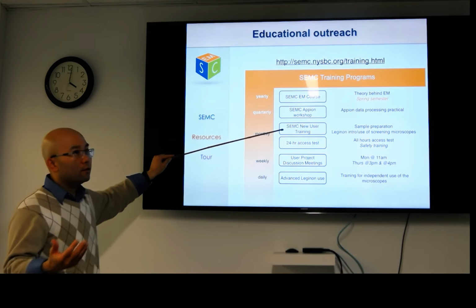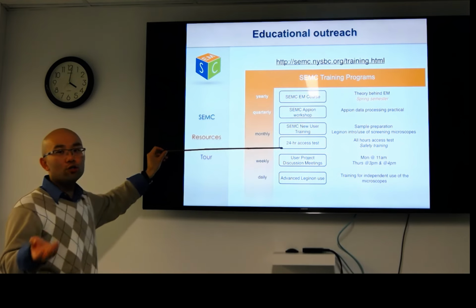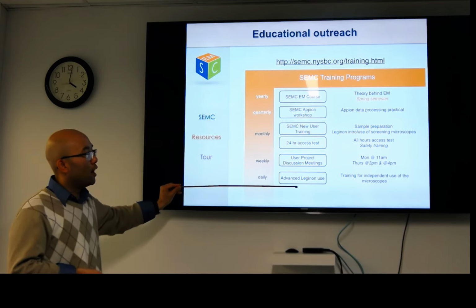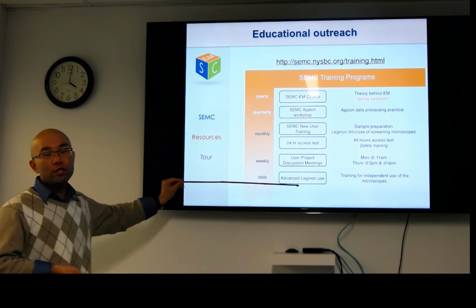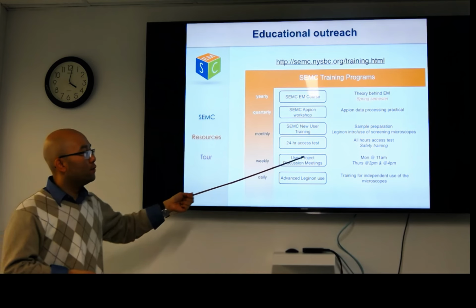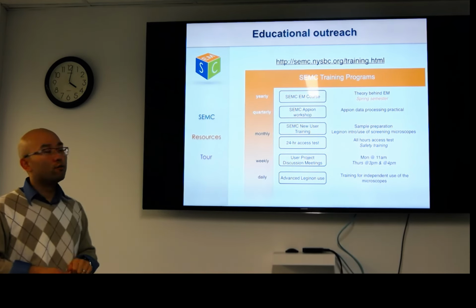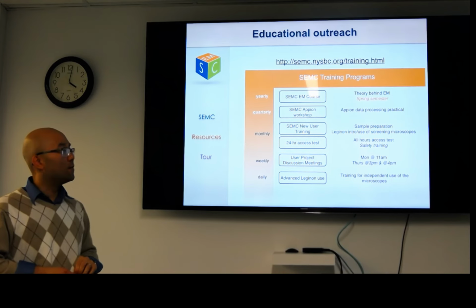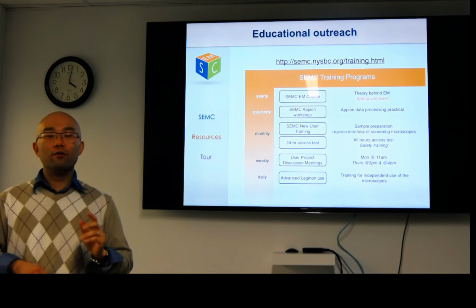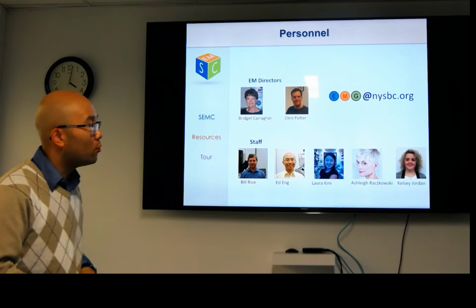The third part of using the facility is really how you collect data. Once you have a sample, how do you use the microscope? Through new user orientation and our one-on-one sessions, we'll teach you how to use the microscope. In addition, we have quite a bit of individual outreach. We have distinct time set aside to talk to you about your project. You've probably heard me say this many times, for those sitting in the room: Monday at 11, or Thursday at 3, or Thursday at 4. If you email us, we can set the appointment.